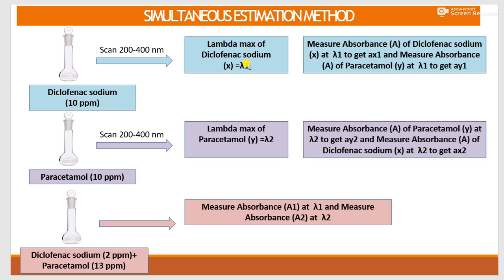Here we have taken lambda 1 as the lambda max of diclofenac sodium and lambda 2 as the lambda max of paracetamol. Diclofenac sodium is our X and paracetamol is our Y. At these two wavelengths, the absorbance of diclofenac sodium and of paracetamol solution is taken to get AX1, AX2, AY1 and AY2.